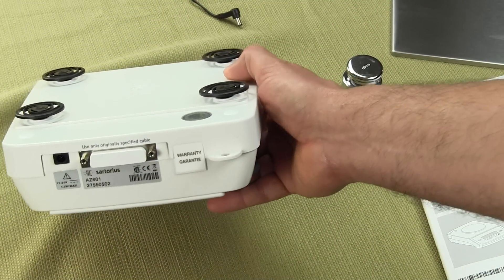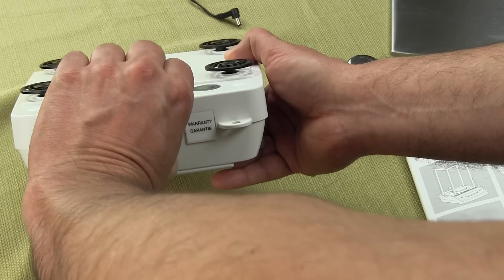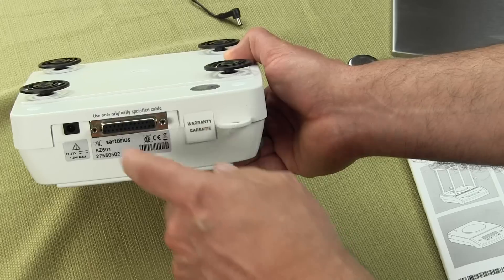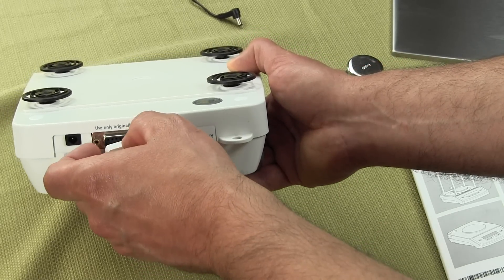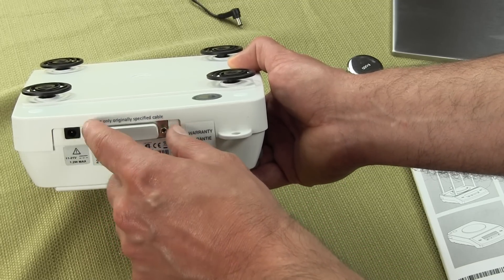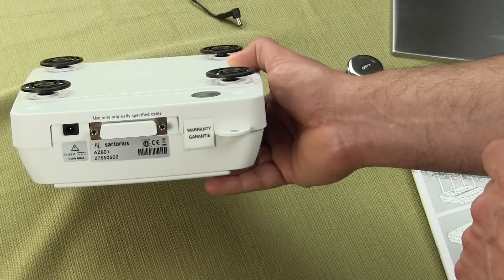On the rear of the scale, we have the RS-232 interface — a 25-pin connector. We do sell the cable; it is an option. If you wanted to tie it to a PC, you have to buy Sartorius's cable — this is not a standard serial cable. It's a special cable; you have to buy Sartorius's cable to make it work.